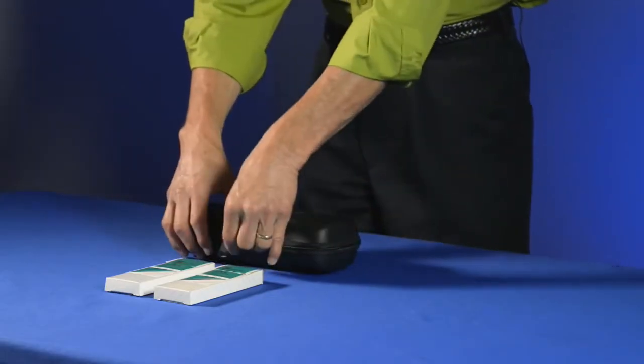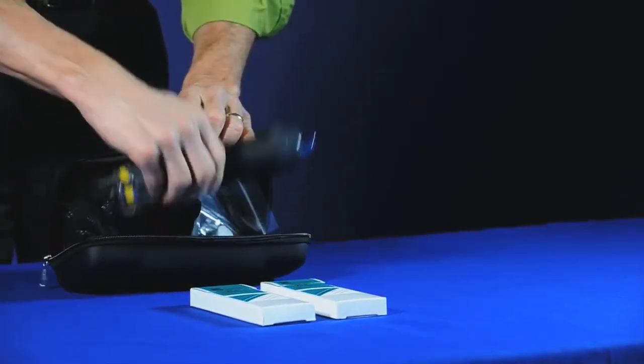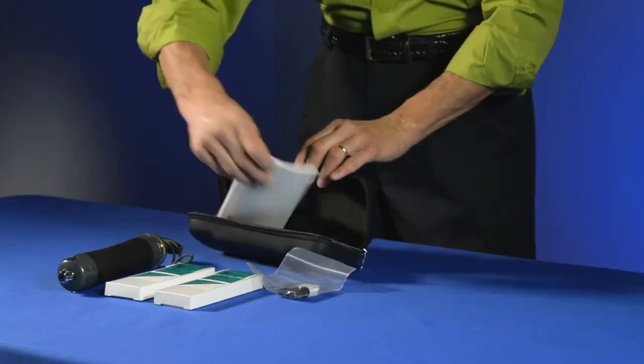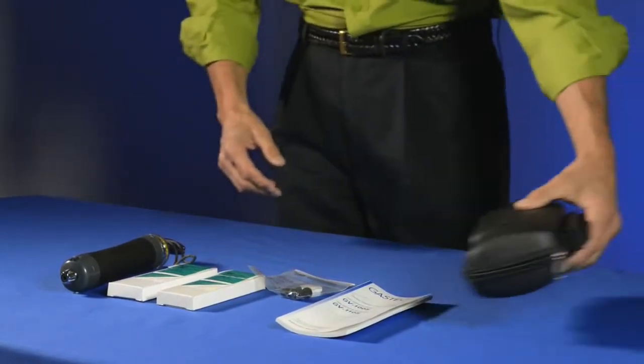The first part of the system is the actual GAS-TEC pump. Along with the pump we have a small maintenance kit and an instruction manual. The manual is an important thing to review before you do your sampling.